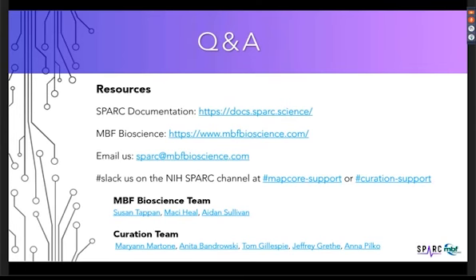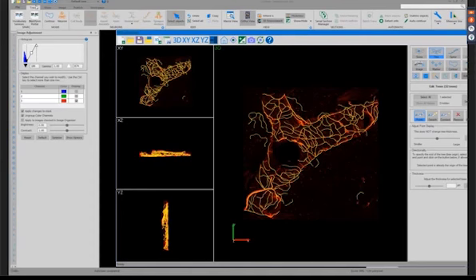Can you show the Blackfynn connection? Absolutely. So here, next to vocabulary services, which is where you would access the dialogue that we talked a lot about today to add metadata and access your ontology list, there's also an icon here for the Blackfynn portal.